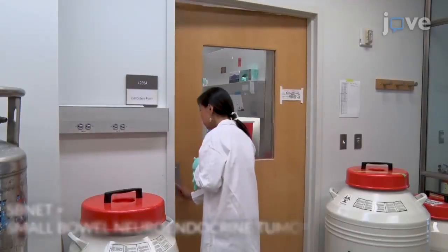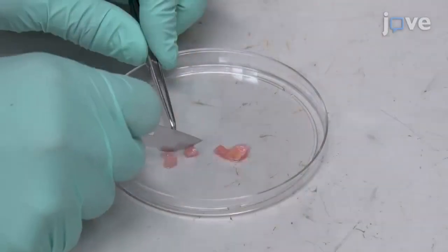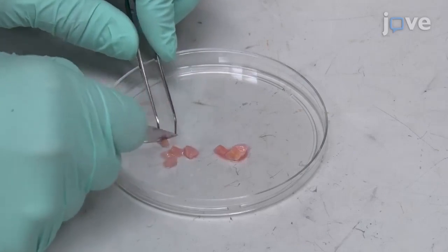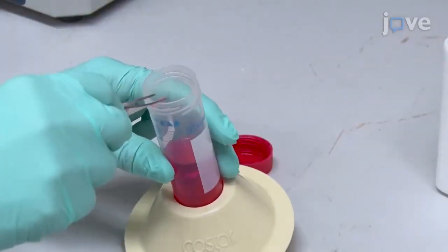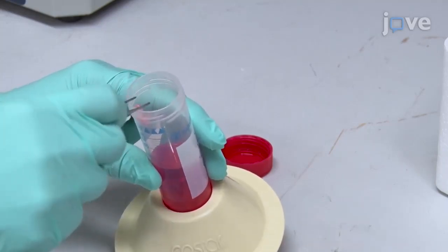After obtaining a resected patient SB NET sample, cut it into 5 mm cubes and store it in 25 ml of DMEM F12 medium in a conical tube for transportation.